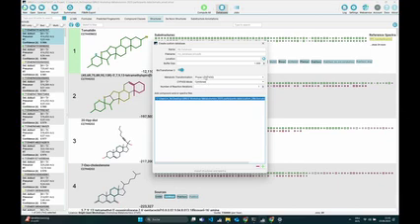If you know BioTransformer, you can select the different transformations that you would want to apply. You also have some more settings here, and you can set the number of reactions that you want to perform. If you do this, the custom database will not only consist of the structures that you put in at the beginning, but also of all the transformations that you have made with BioTransformer.